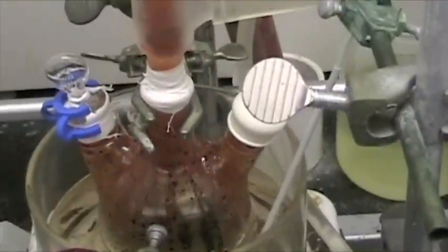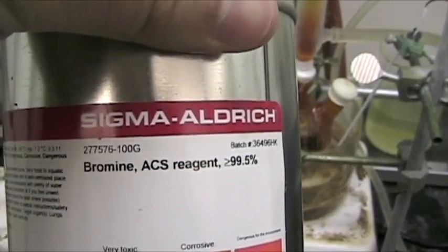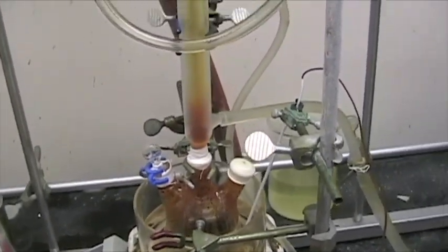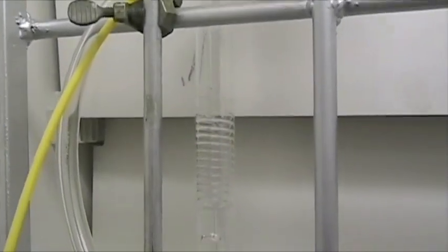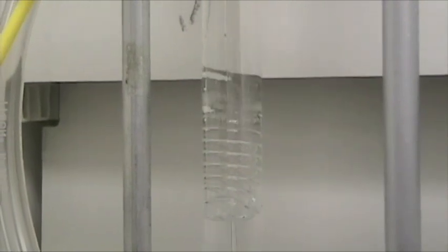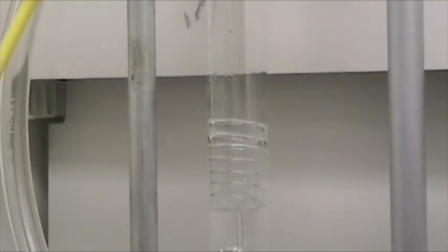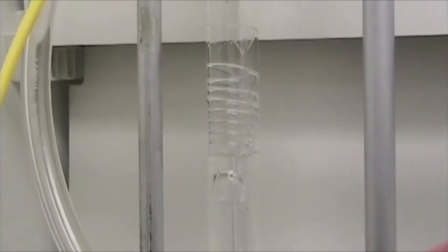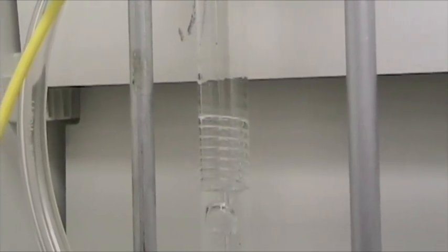And that stuff just happens to be bromine. Although I really love the smell of bromine — don't tell anyone I said that. Something else interesting I've noticed here in my fume hood is — this is nitrogen flowing through oil — I think it's neat how it stacks up the bubbles once it gets to the top of the oil. A minute ago it was going much much further up, but I think it's cool how it stacks the bubbles like that and then they pop.